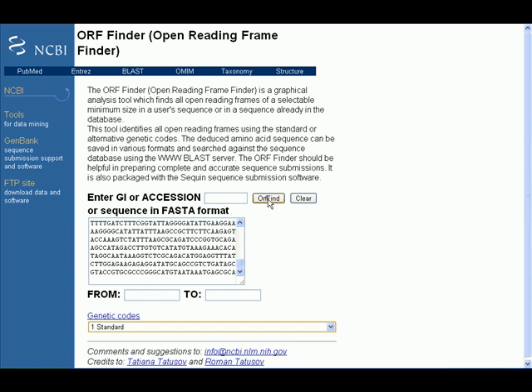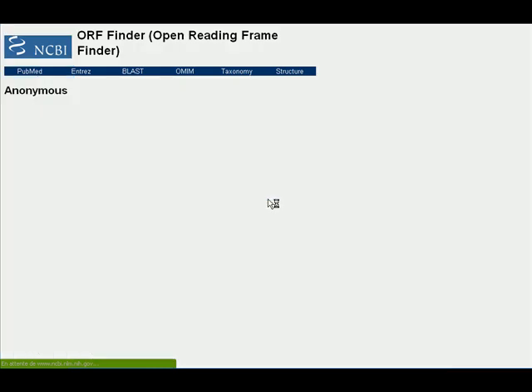Click here on this button, ORF Find, and we wait a little.